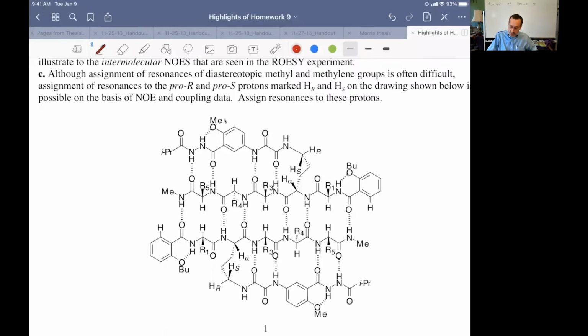And so even if you're not sure of it, you will have a hypothesis that maybe this hydrogen and this methylamide NH, maybe the hydrogen at the 6th position of this aromatic ring might be close. So we might look for that NOE. We might expect to see this NOE as well. So again, I'm going to put question marks here. We might expect to see that NOE. We might expect to see this NOE here. So I'll put question marks for all the things we might look for.